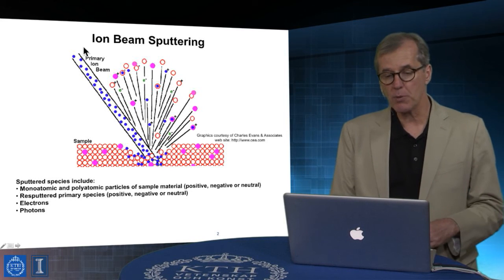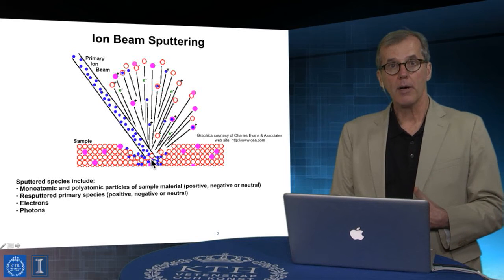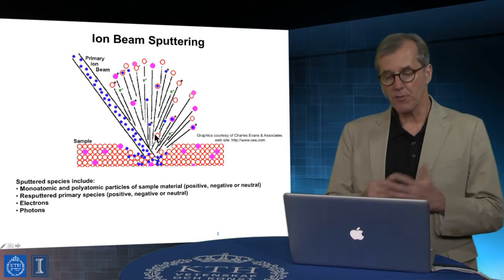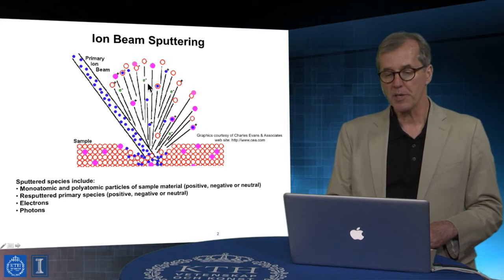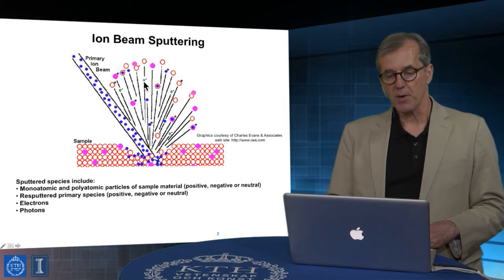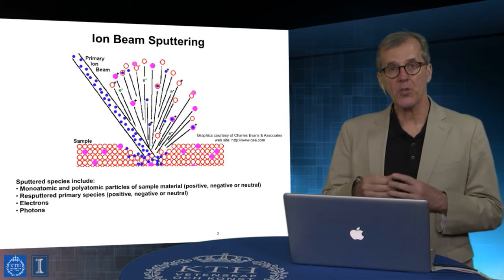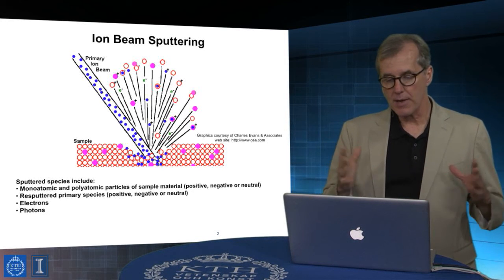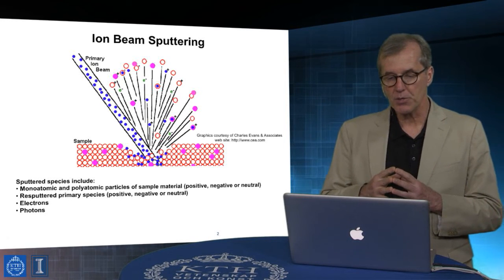The energies associated with the primary ion beam are sufficient to actually emit matter in diverse form with diverse masses in broad trajectories. And also we'll see imparted in here electrons, right? E minus, electrons. We're also at energies that are sufficient to actually ionize materials as well. So we have generated in this particular way very complex compositional characteristics.